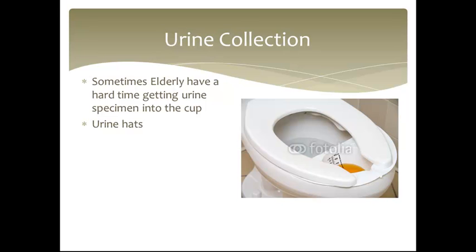It's not particularly good to use this collection method for a clean catch midstream. Some physicians will do this method and still order the urine culture. However, it's really physician preference in what they would like their patients to do, so it's important to check with your physician. However, if it's a random urine catch, non-sterile, you could use a hat for those elderly people.